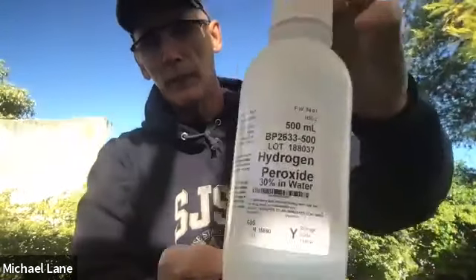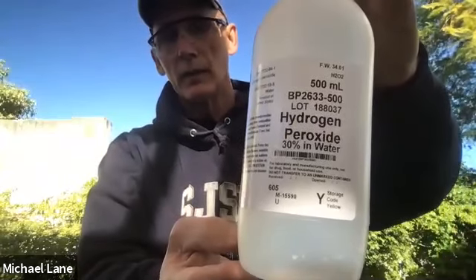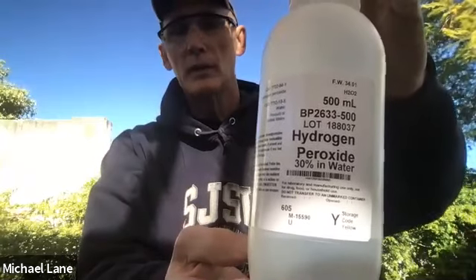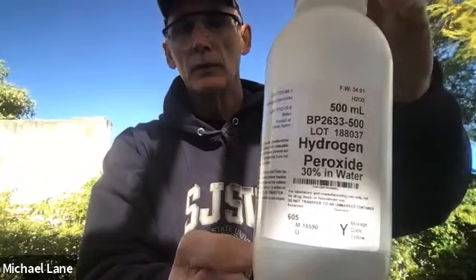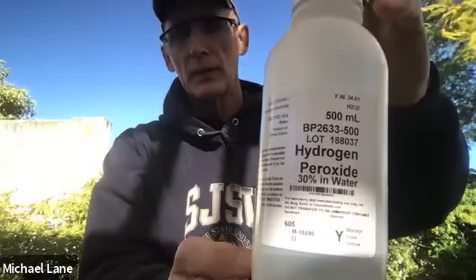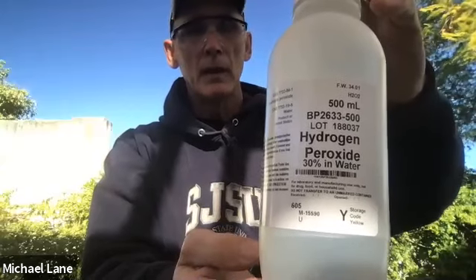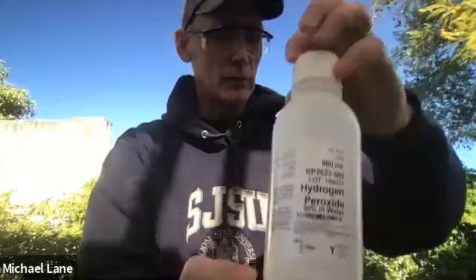Perhaps you've seen this demonstrated before. This is hydrogen peroxide. Note that it is 30% in water. The hydrogen peroxide that you may have in your medicine cabinet or underneath the sink in your bathroom, if you do have it, is 3% in water. So it's the same chemical, simply a different concentration. Hydrogen peroxide has the molecular formula of H2O2.